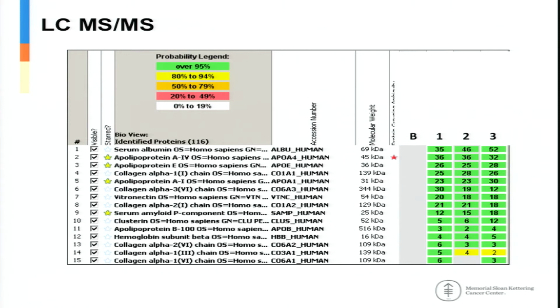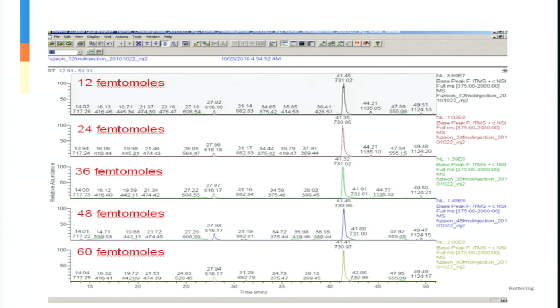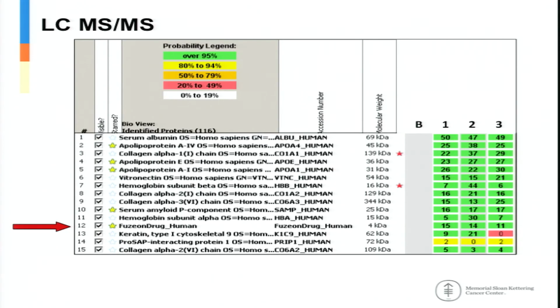We microdissected it, another one of those puzzles. We had all the amyloid signals, but nothing else. Jason Thie is our chief technologist there. He went to Wikipedia and looked at the drug. The drug is actually a viral analog peptide. So this is a viral mimic. It's not a native peptide. It mimics a viral protein and prevents HIV binding to CD4 cells. So he went to the pharmacy, got one, and we checked whether we could see this peptide in the mass spec. We could. Then we got the sequence of that peptide and added it into our database. Bang, it was there. So it's a single peptide.